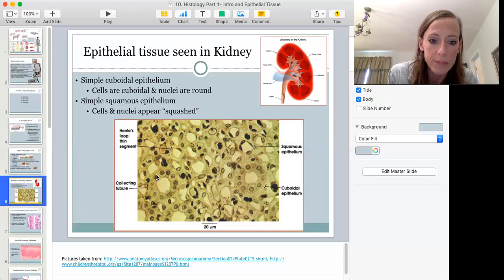So if you look here, this circle has bulbous nuclei to the cells and relatively cuboidal shape to the cell itself, right? And if you look, it's got one side exposed to a central cavity, and then the other side is a single layer, okay?